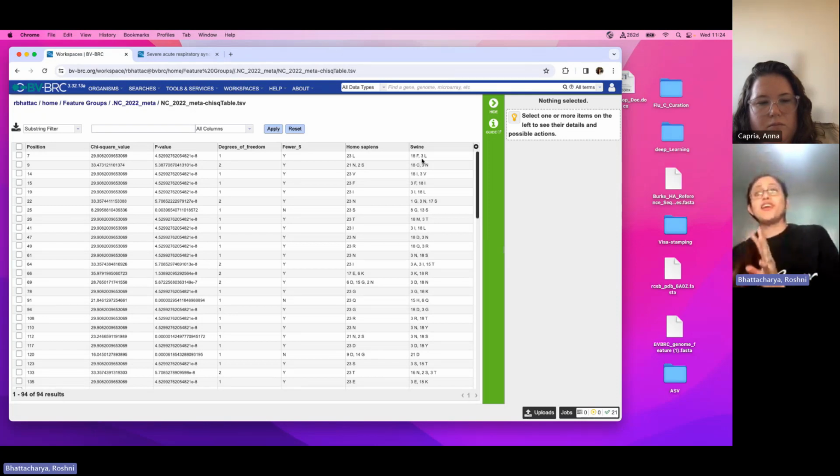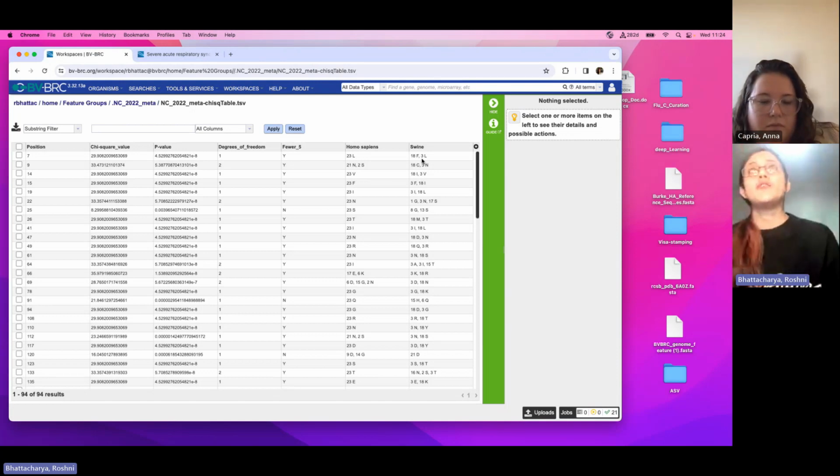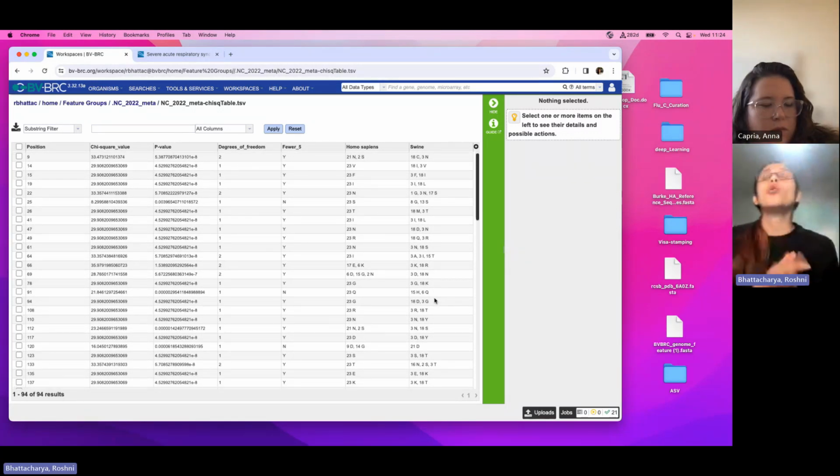Remember, the 3 probably are those which lie in the human branch from our phylogenetic tree. See, for the most of it, the 3 swine residues resemble what is in the human group. So another evidence that these 3 strains are more like humans than the swine.